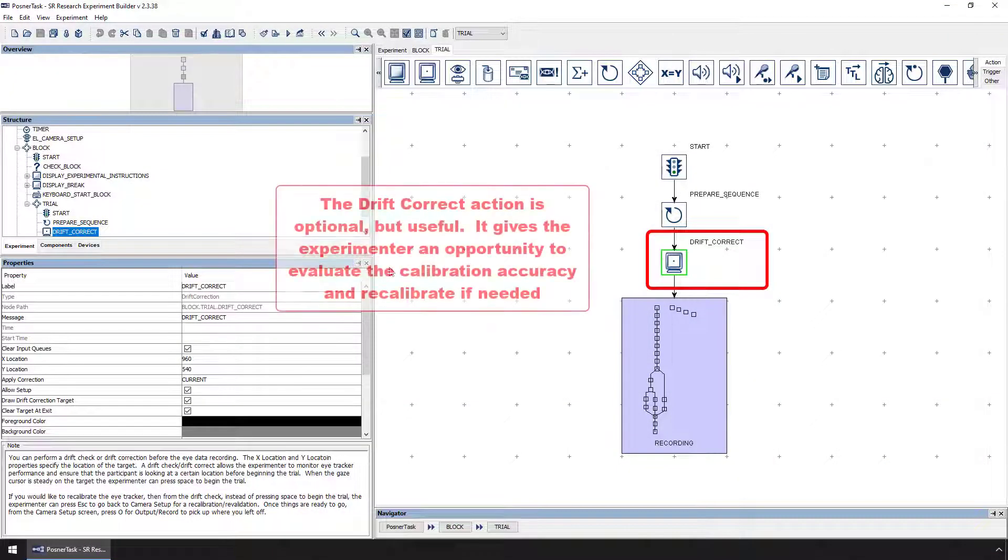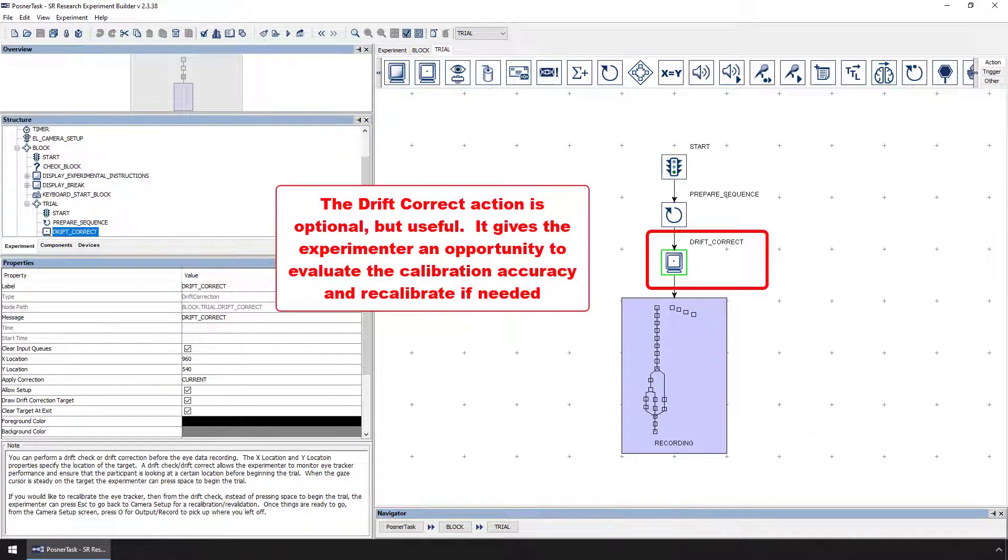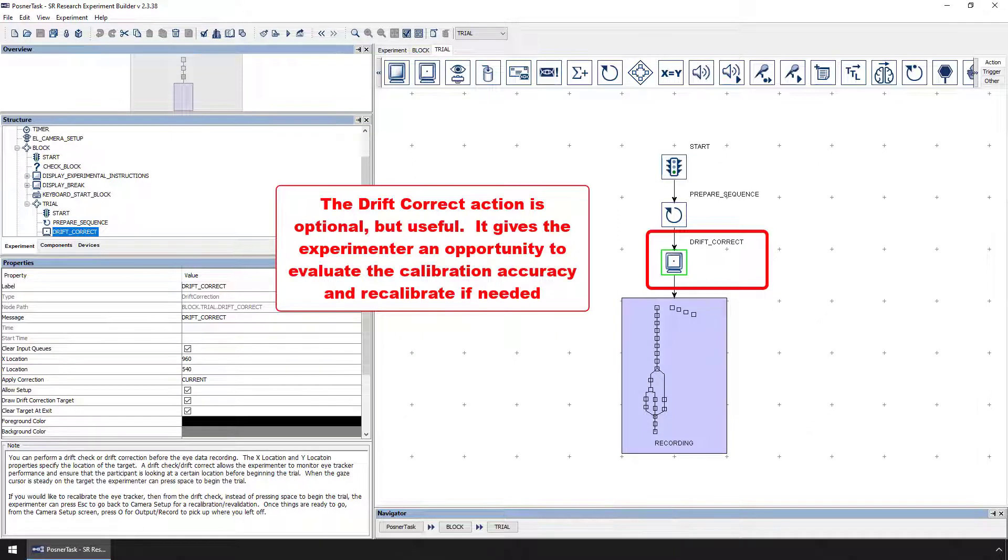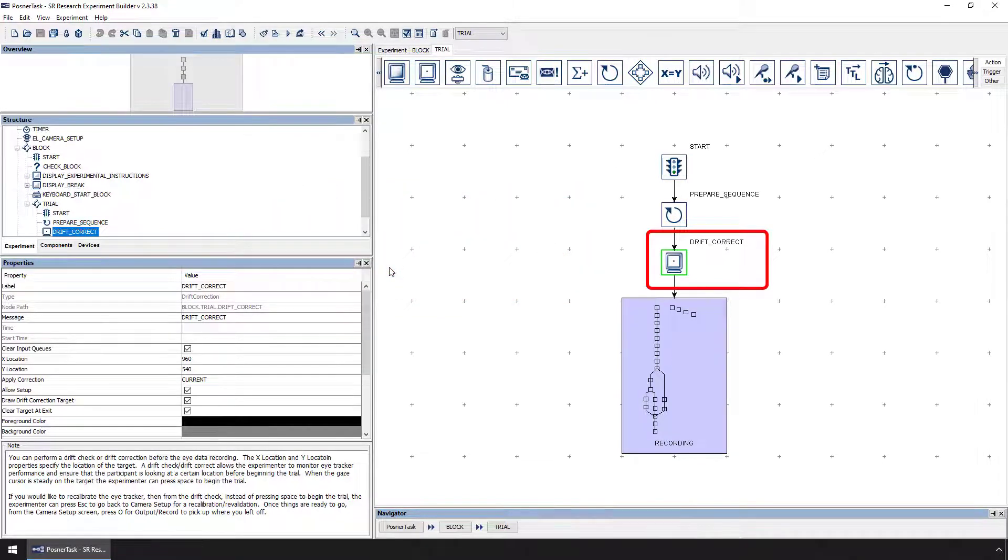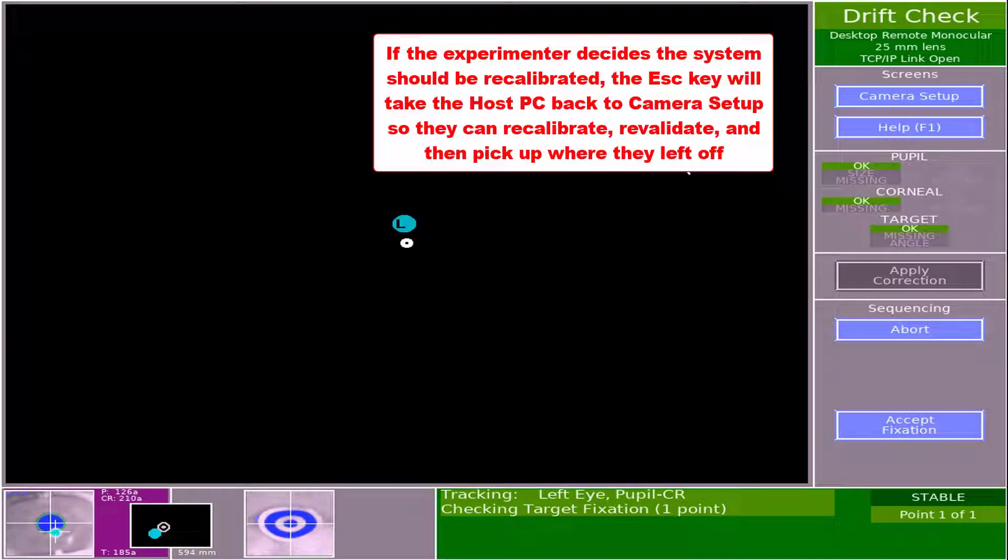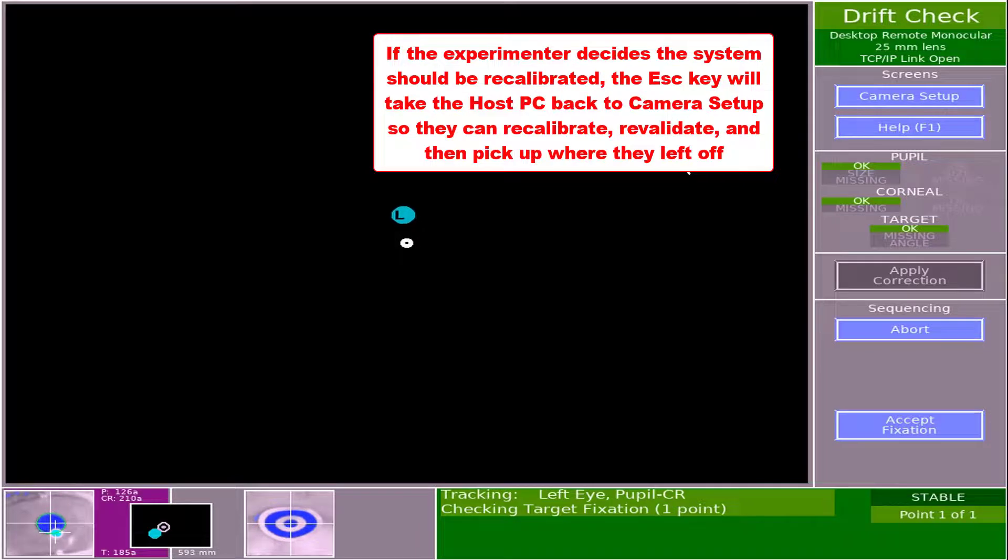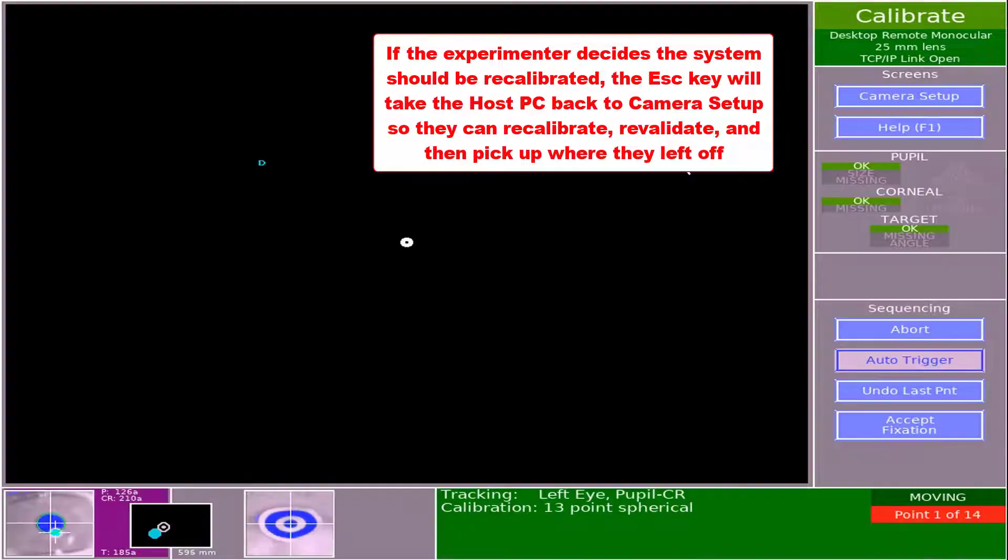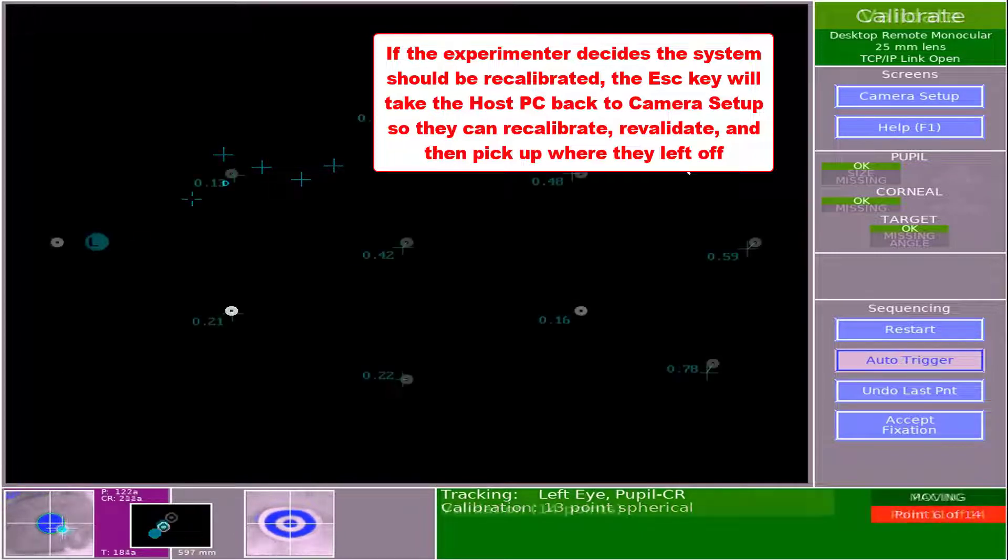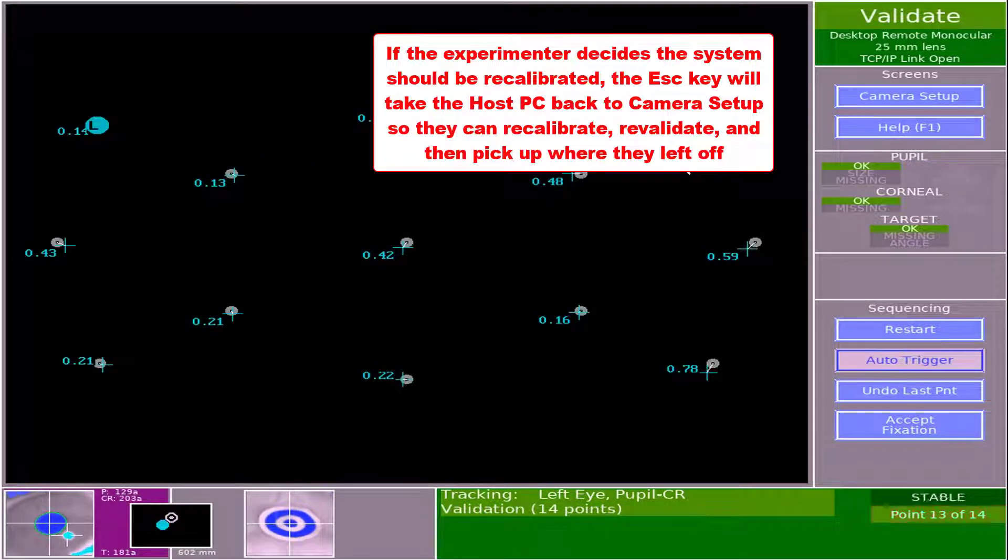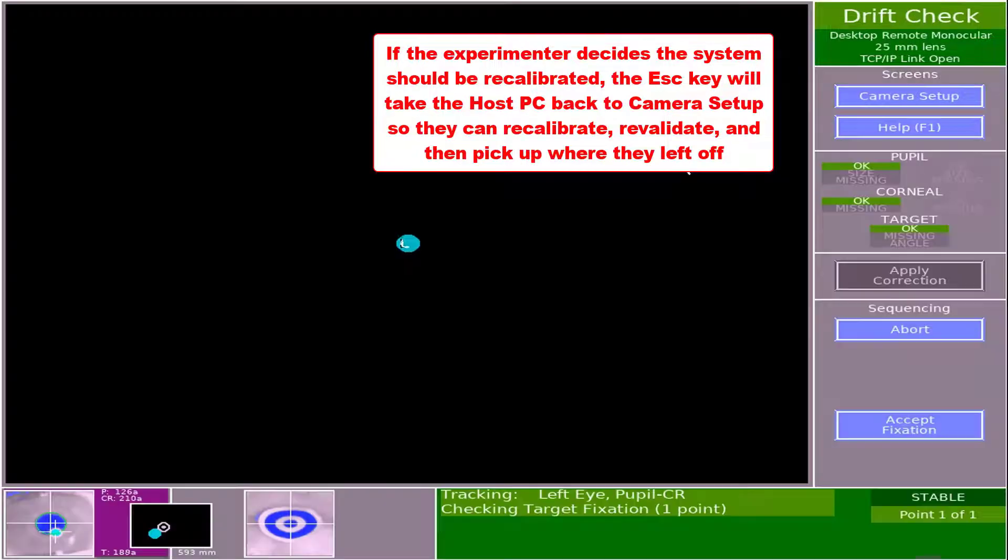Note, the Drift Correct action is optional, but often it's a good idea to include this in your project. Besides helping to ensure that the participant's gaze is at a certain location when the trial begins, they also give the experimenter an opportunity to evaluate the accuracy of the calibration model. Moreover, if the experimenter decides the system should be recalibrated, then instead of pressing space bar to begin the trial, the escape key can be pressed to put the display PC and host PC back into camera setup mode so that you can recalibrate and revalidate. Once recalibration is complete, the experimenter can press O or click output record and the project will pick up where it left off.